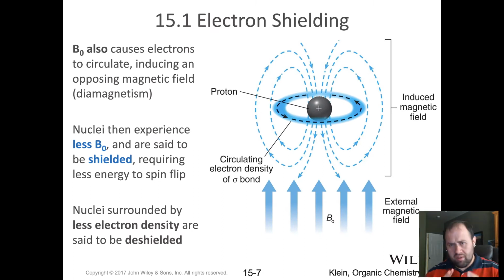That's the key to it: it depends on how much energy split there is between the opposed and aligned states. That determines what frequency of radio wave is absorbed, or more specifically emitted, but we'll get to that in a moment. And we have this slide a little earlier, and it's just mentioning what I was talking about there.